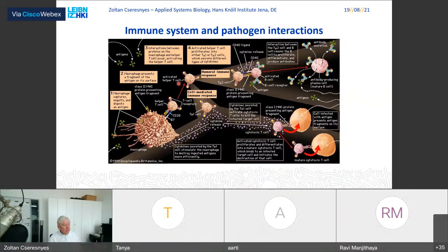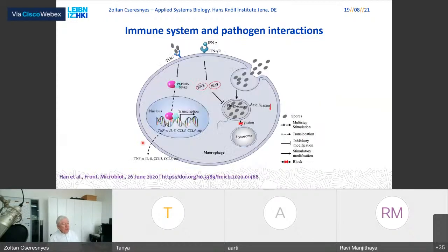So out of this big universe of the immune system's most basic functionalities, we will focus on this small part here, where we study the macrophages, either labeled or unlabeled fluorescently, and their interaction with pathogens. What happens when a macrophage meets with a foreign body, which should not be in our body?